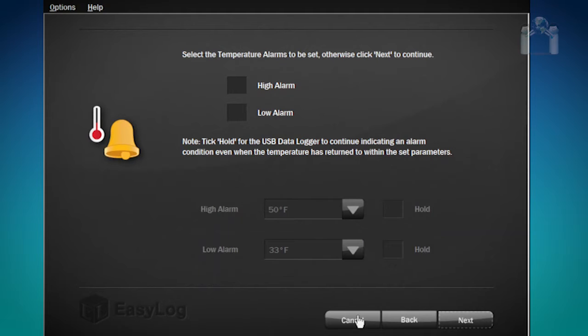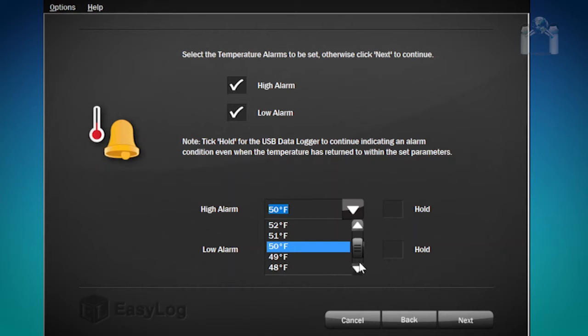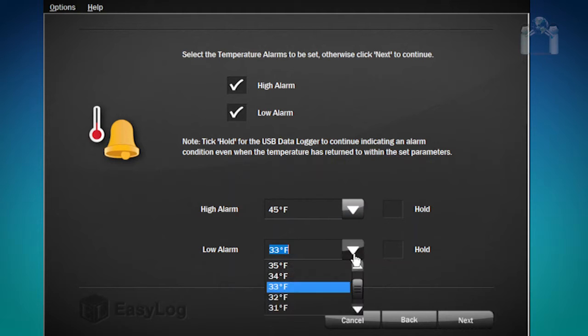The next window is for configuring alarm settings. You can choose to set a high or a low alarm by clicking the box next to the alarm. Check both boxes and you will receive alerts from both. With both boxes checked, you need to tell it when to activate the alarm. Starting with the high alarm, I will click the drop-down box and select 45 degrees. For the low alarm, I will set it at 32 degrees. You may have also noticed there is a box to the right of the temperature alarm settings with the word Hold next to it. If you want the data logger to inform you of an alert condition even after conditions return to normal, check the box. This can help you in case something happens, such as a temporary loss of power.